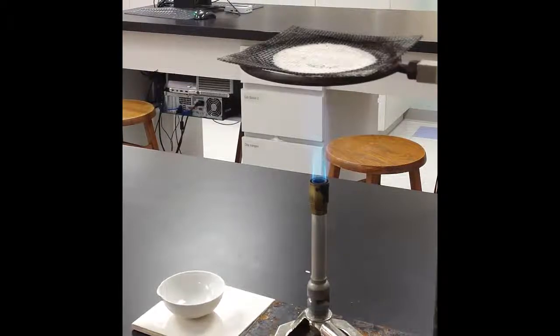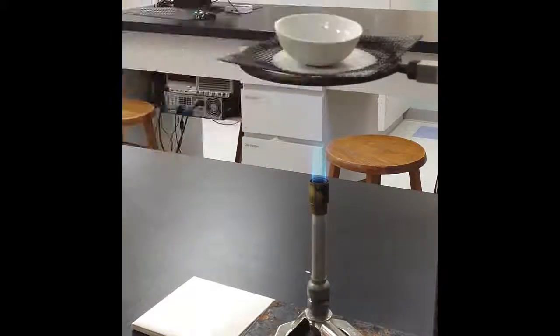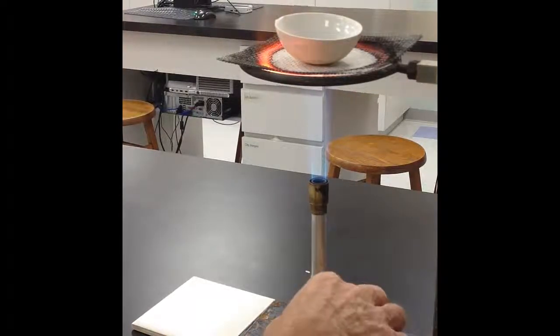If it does not melt easily, then heat it more vigorously to see if it can be melted at a higher temperature. Record the results of the ease of melting test as melts easily, melts with difficulty, or does not melt with the Bunsen burner.